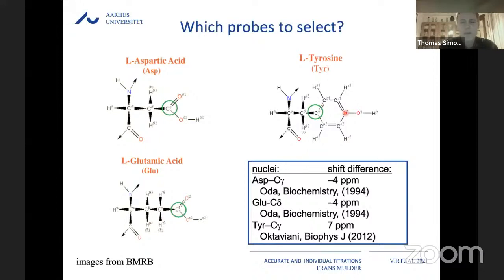So is it routinely successful to fully deuterate the arginines when people do these neutron structures? I realize it's not your structure, but I thought there might be people in the audience who know a little bit about this.